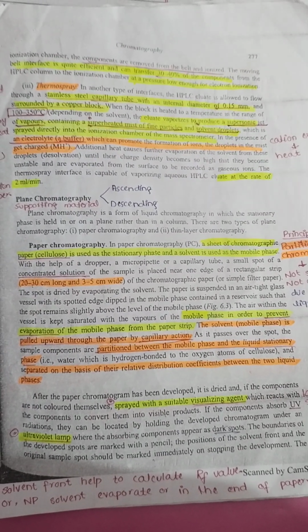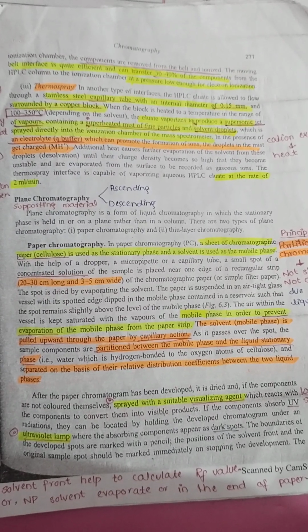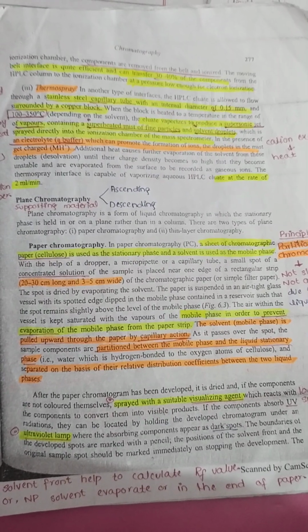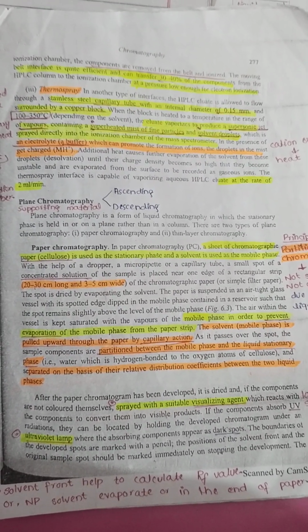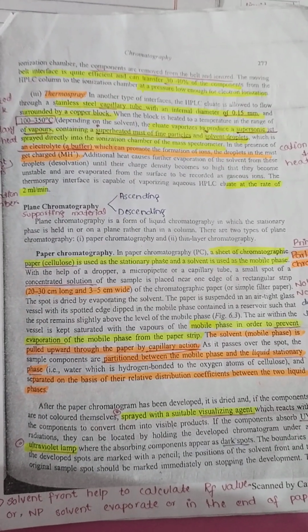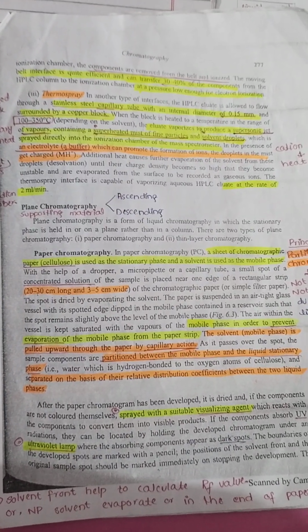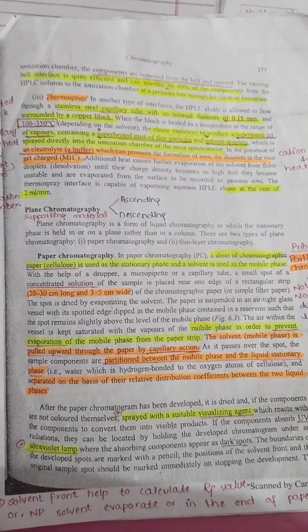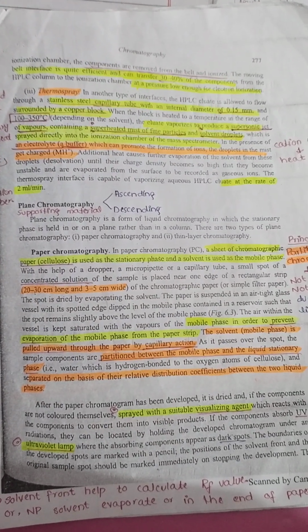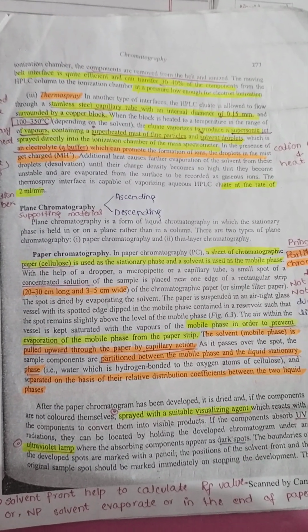Now in planar chromatography, we discuss two types: paper chromatography and thin layer chromatography. These two types of chromatography work in a similar way. Now we discuss paper chromatography. There are different types of paper chromatography, sometimes ascending, descending, and radial chromatography.